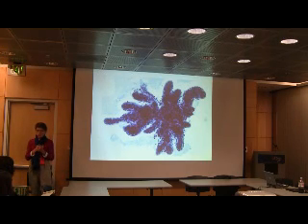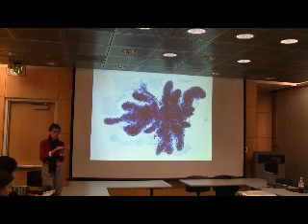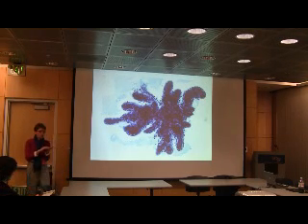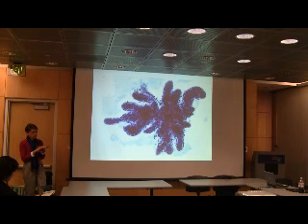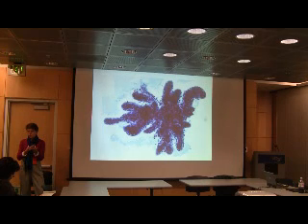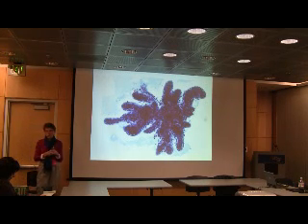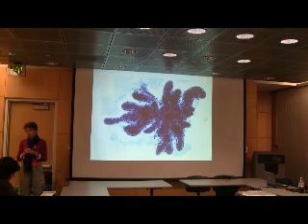But there's a shortcut. You can take the piece of tissue and put it into a cryomold. There's a medium called OCT, I'm not even sure anymore what it stands for, but you can use that instead of the paraffin, and you freeze it, and then you cut similarly thin slices from that frozen material and put it on a slide and stain it with H&E, and you can have that within 10 minutes. It goes pretty quick.